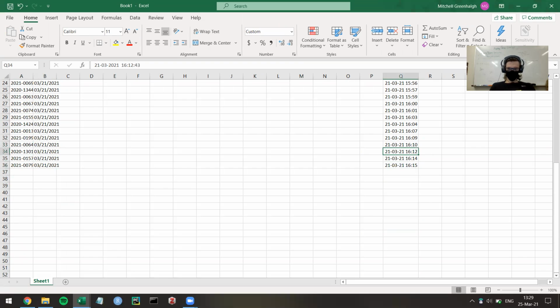So you just want to make sure that you are aware of which timestamp is the actual one for the real run in the case of rerunning a sample. And so if that were the case, you would just delete this one if it were the first run and not the second real run, and then you would just move everything up. But everything's looking good now.